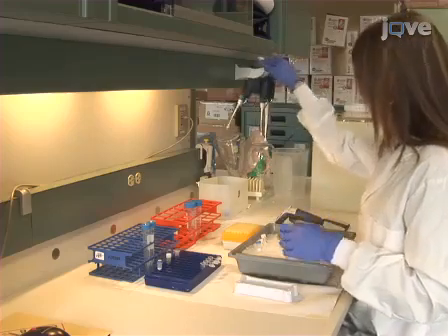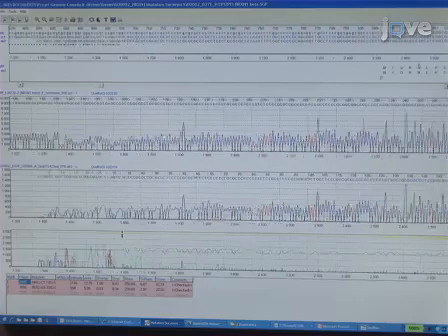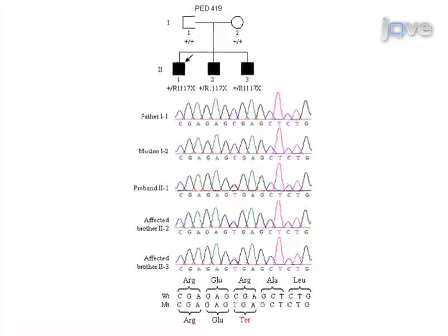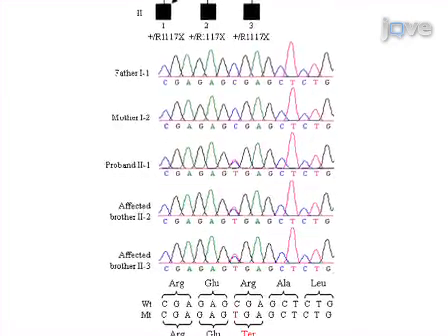As a final step, for each novel exonic variant, eliminate technical artifacts by re-amplifying by PCR and resequencing the region of interest from DNA extracted from blood samples from the patient and both parents. Performing this step on blood DNA is important, as some mutations may be due to artifacts caused by the division of cultured lymphoblastoid cell lines.